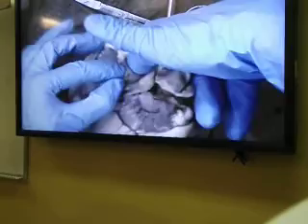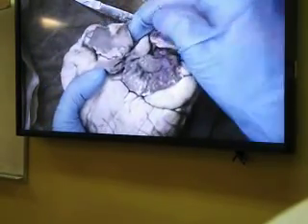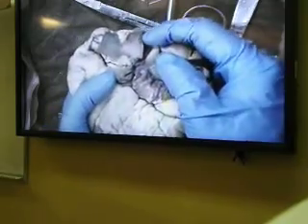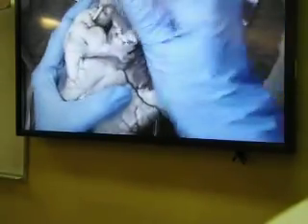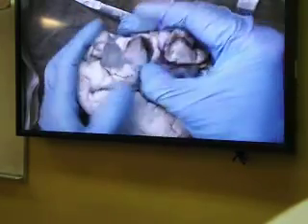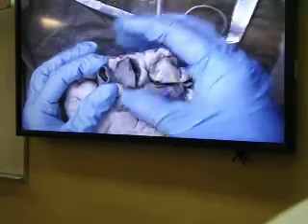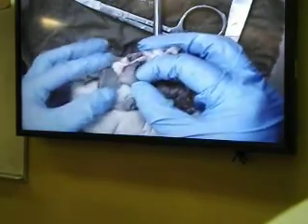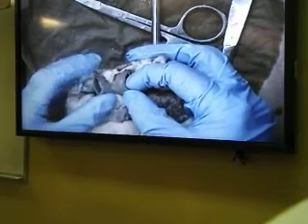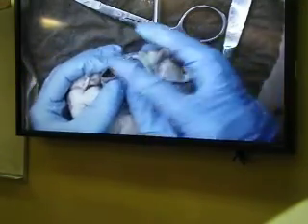So if the probe or finger is going to this chamber, which is the left ventricle right here, this blood vessel has to be that artery which we call the aorta, from which all systemic arteries start. Okay. So this is the aorta, but then right by the aorta you see this blood vessel with a smaller hole. This blood vessel actually came from the aorta, which you do not need to know for practical, but after practical we will talk about it in detail.